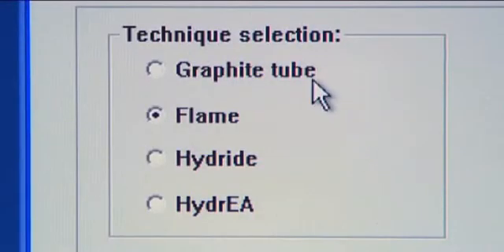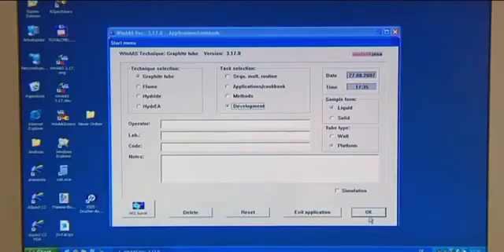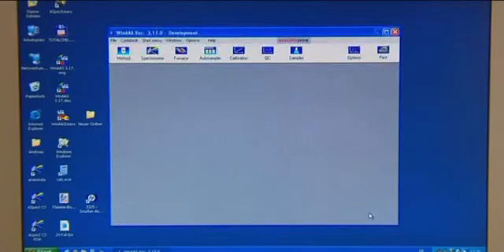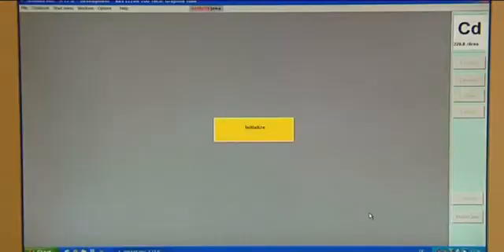Changing over between the flame technique and the graphite furnace technique involves only a mouse click. All instrument settings are software controlled. Due to the mature design, there is no need for any expensive adjustments.